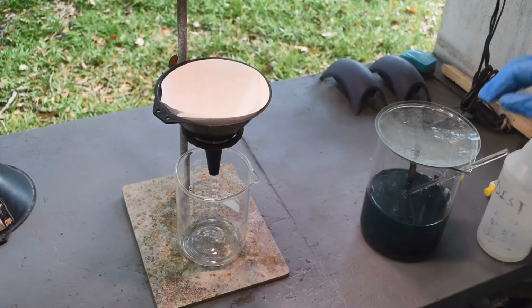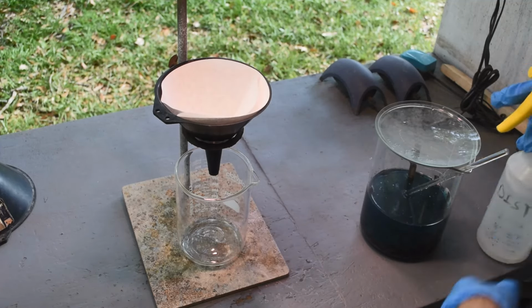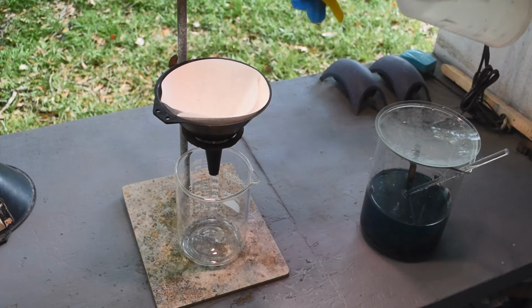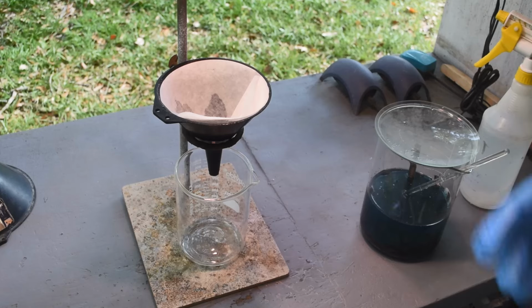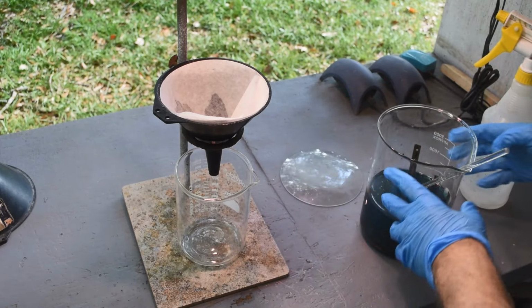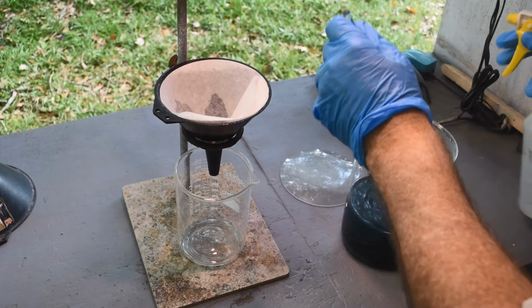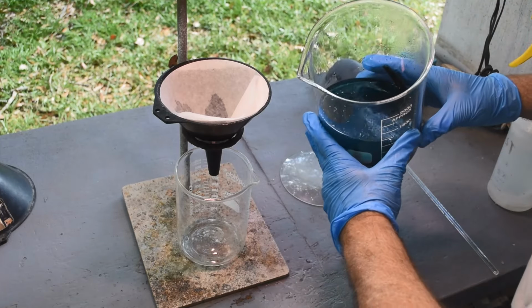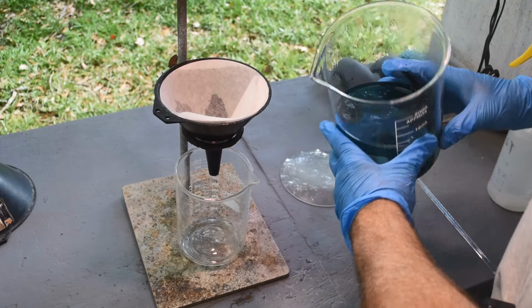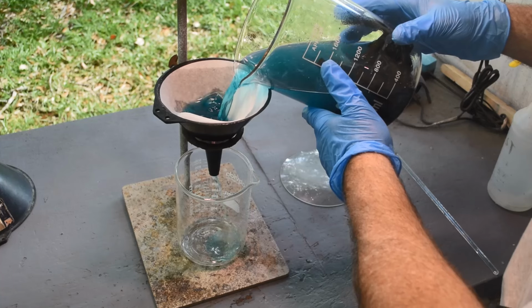All right, so my intention here is to filter this liquid off and catch any bits of palladium in this filter here. Now, Joven, if you're watching, I'm using a lab grade filter. You can probably just get by with coffee filters for this. I don't think you need anything special. So there are some floating bits of palladium in here, so we are going to try and catch them so they don't go to waste.